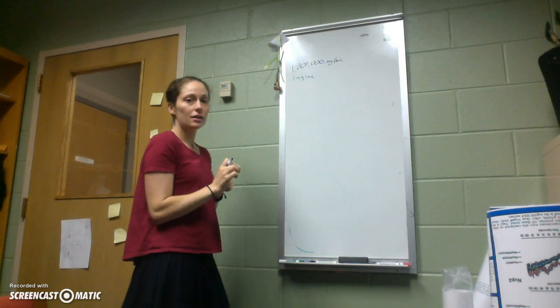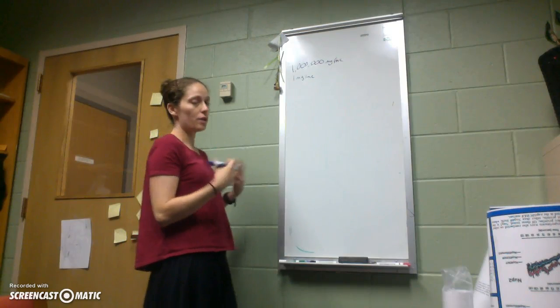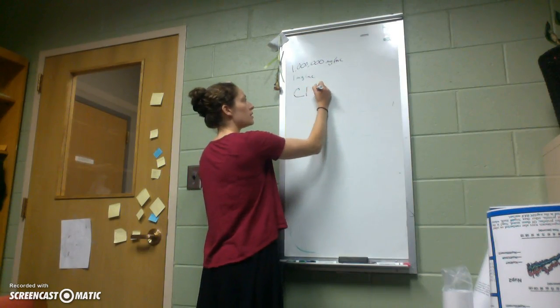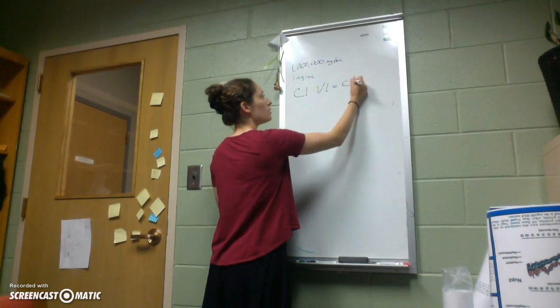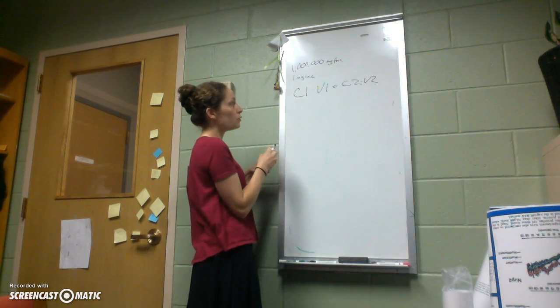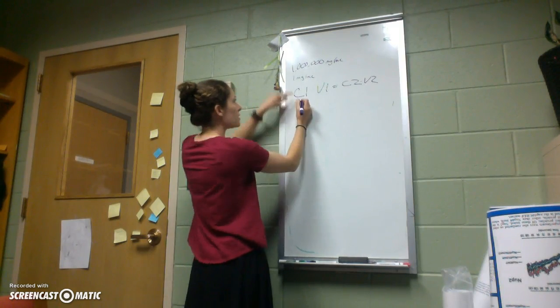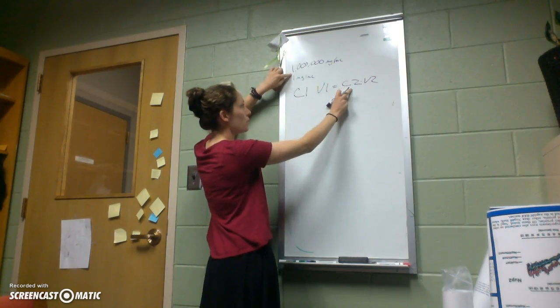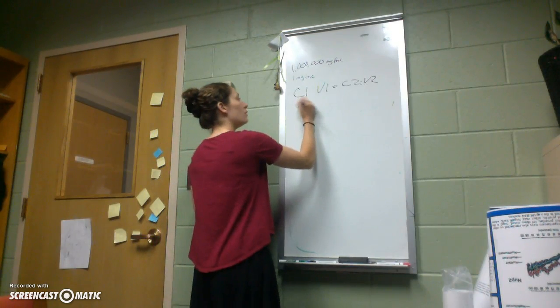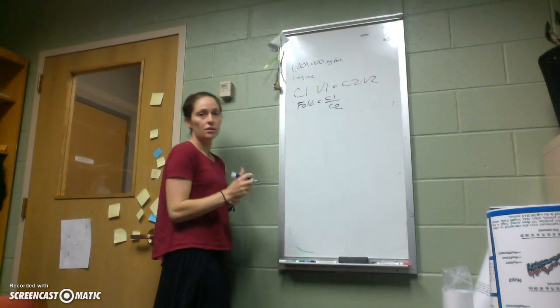We talk about that in terms of fold dilution. This would be a million-fold dilution. It's going to end up being 1 million times more dilute. In terms of our equation, remember C1 V1 equals C2 V2. And when we're talking about fold dilutions, that's really C1 over C2 would be our fold. So we'd start with 1 million mgs per mil, we'd end up with 1 mg per mil, and that would be a million-fold dilution. Fold equals C1 over C2.